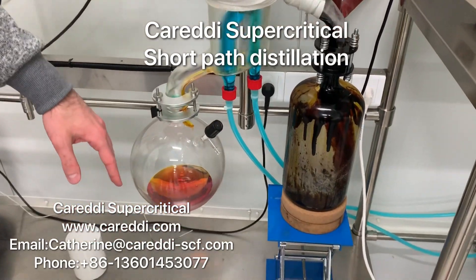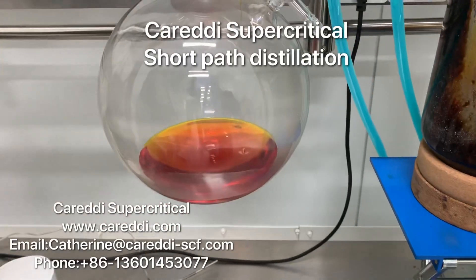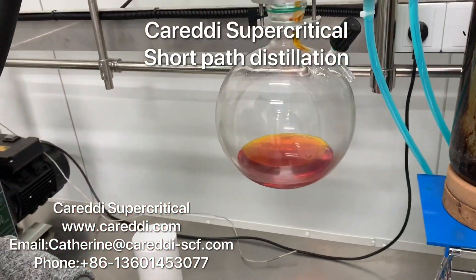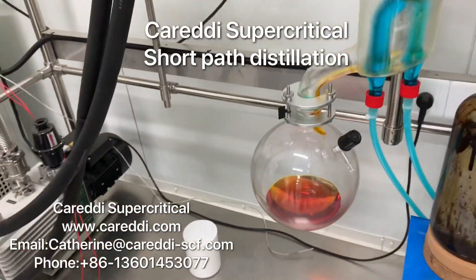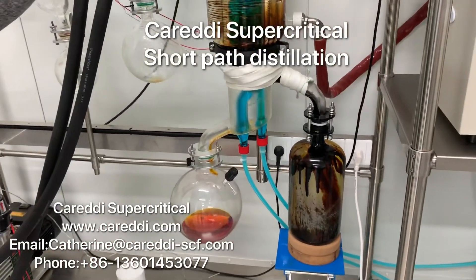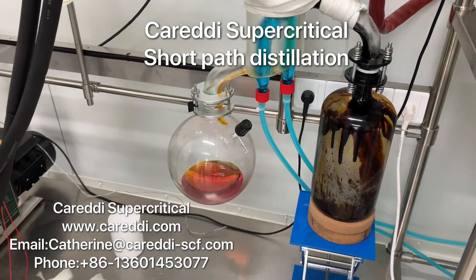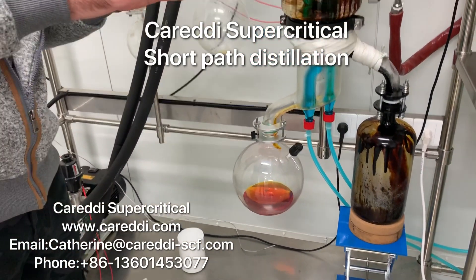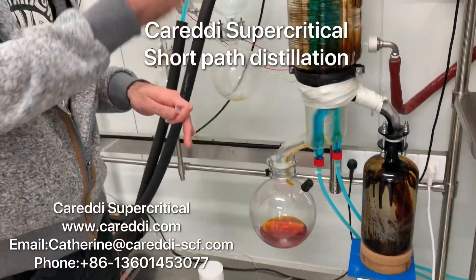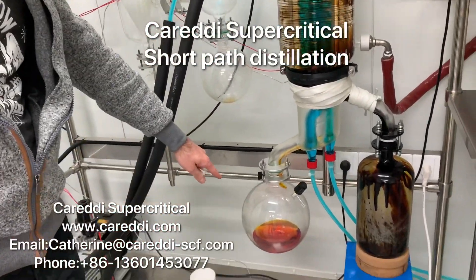The material we use is about 90% CBD and 0.3% THC or less. During short path distillation, the THC can sometimes rise up, but we know how to deal with it so that the THC will never go up, and we know how to clean this.